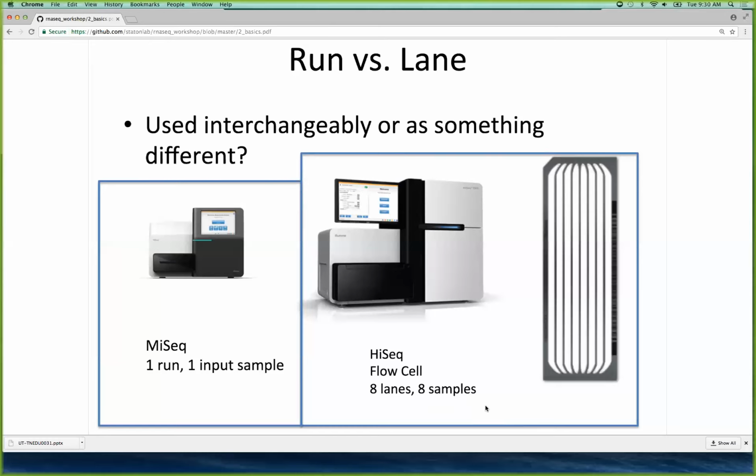Because the library prep is from the extracted total RNA, the sample ready. No, that usually doesn't include extractions. Okay. You send a tube of RNA. Is that the mRNA or total RNA? Okay. I usually pay for the sequencing facility to either do an mRNA selection or a ribo removal. But you can do that yourself, so it kind of varies, what you want to do in your lab versus what you want them to do.